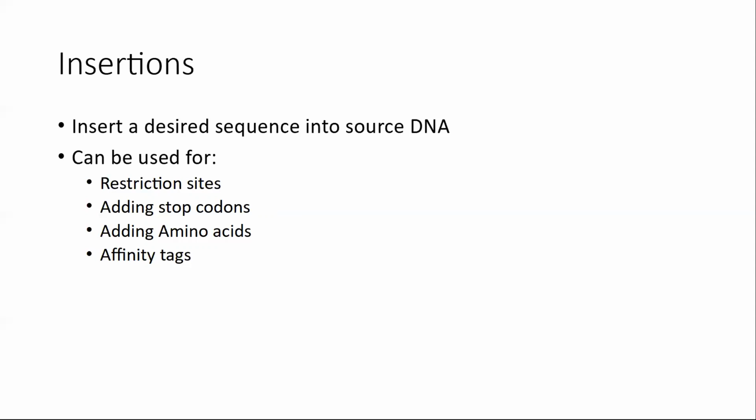And this can be important because sometimes you want a certain tag or a certain plasmid for expression in other systems, such as human or yeast expression. And the engineered vectors or plasmids typically have a certain cutting site arrangement. So it can be hard to natively find those things in the source DNA. So being able to add those in is a huge advantage of this technique.